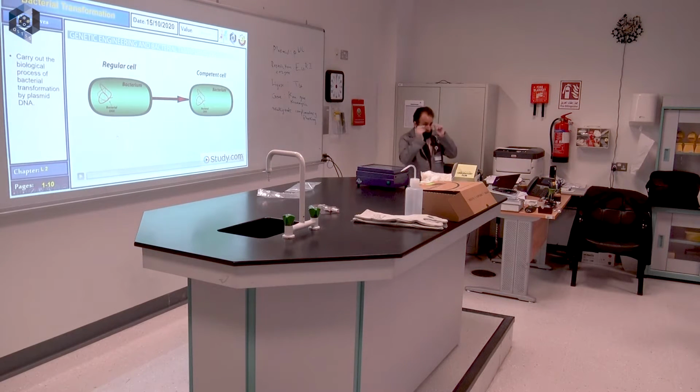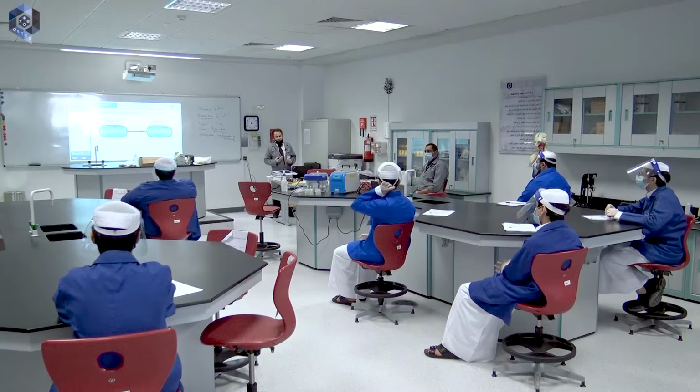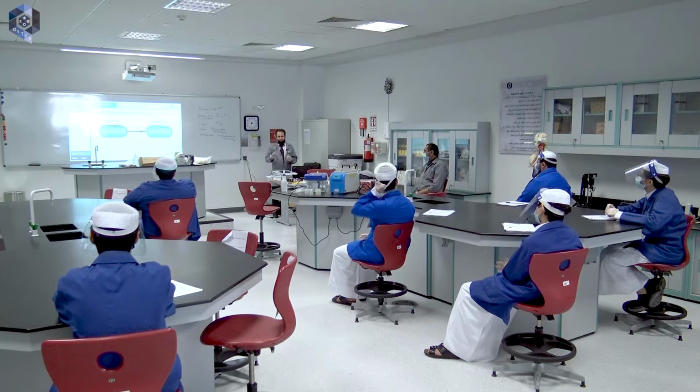Now again, to convert the E. coli into a competent bacteria, what things do we need to do? Who can remind us? Yes, Shahwani. Calcium chloride. What do you think, Mary? Why do we need to add calcium chloride? To break down the cell membrane.